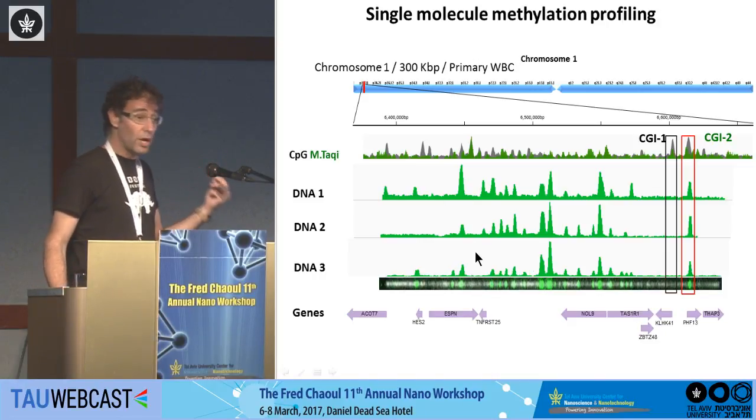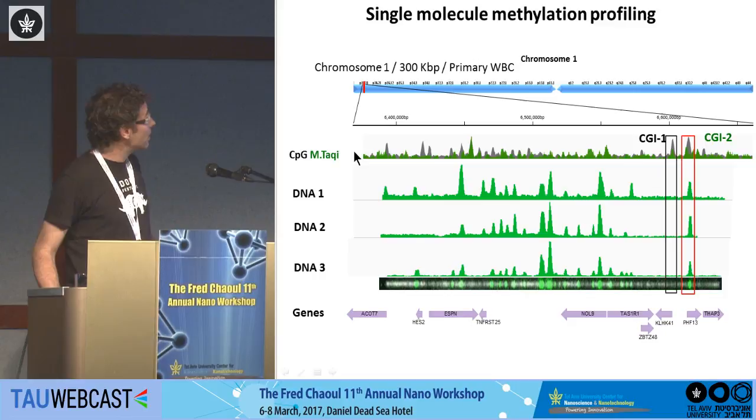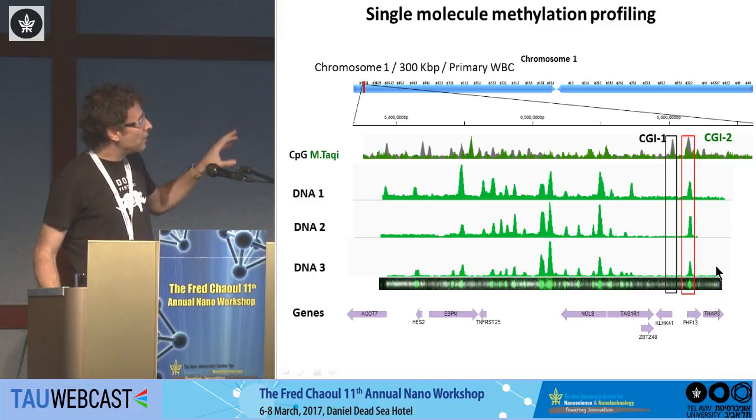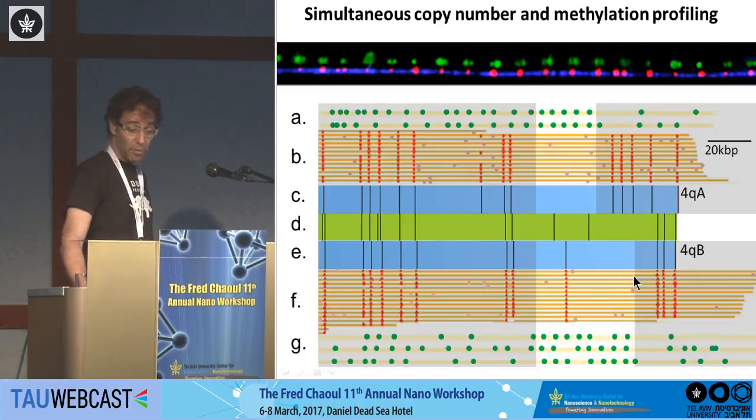And we actually have now a way on the single cell level to see these differences in methylation. Another thing to look at, this is the reference of all the CpGs in the genome, the gray lines. So we can detect here two CpG islands. And these are associated with these two genes. And we can see very clearly that one of them is unmethylated on all three molecules, and the other is methylated on all three molecules. And indeed, this is a housekeeping gene, which is supposed to be very highly expressed, and the promoter is unmethylated. This is a muscle-related gene, not expected to be in blood, and indeed, you don't see a signal, so it's very highly methylated. So I think it's a very powerful technique.